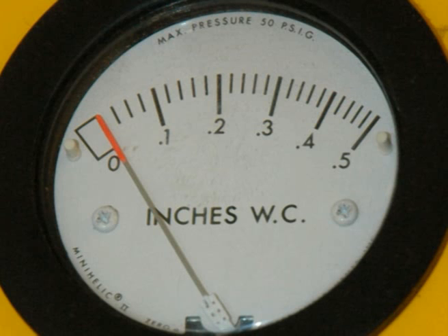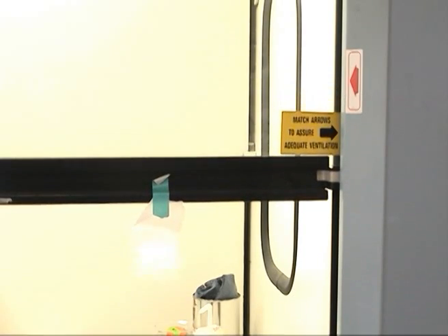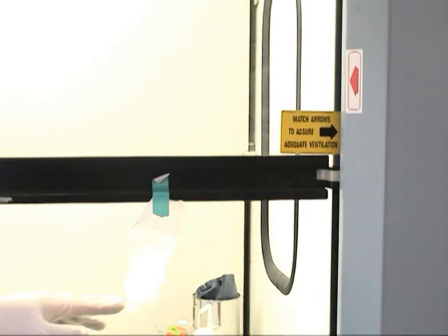If the hood airflow monitor indicates low airflow, first try lowering your sash. If this does not resolve the alarm, contact your department safety coordinator, EH&S, or facilities management for maintenance. Adjust the sash to the proper height. In this case, the glass sash was raised to the maximum working height as indicated by the joined arrow, and then slightly lowered. The tissue on the sash is drawn in, indicating that there is airflow into the hood.